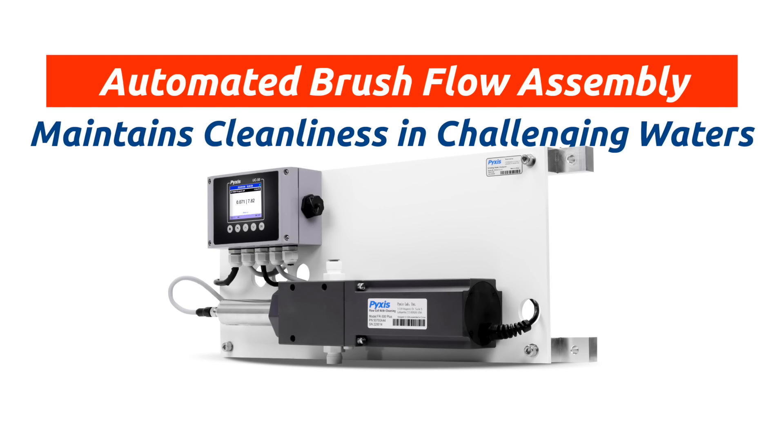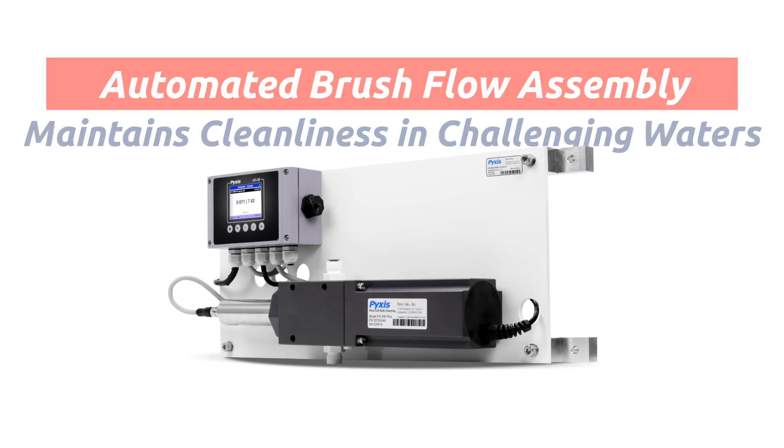The OxyPanel also incorporates an automated mechanical brush flow assembly which is specifically designed to maintain optimum sensor electrode cleanliness in the most challenging water applications. The IK765B is offered in a convenient and easy-to-integrate panel-mounted format for rapid installation and simple maintenance.